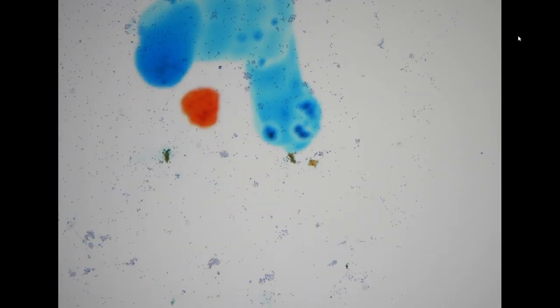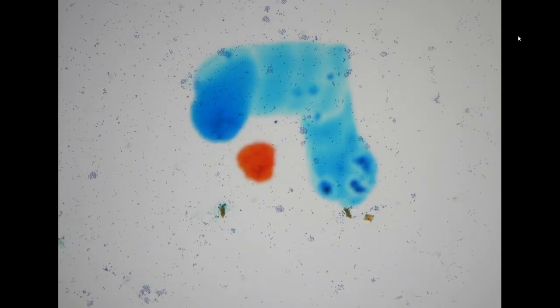The next specimen is kind of similar, except that the patient doesn't have a confirmed history. This is an ascites specimen coming from a 51-year-old female. She came to our emergency room department, and the clinician sent only two specimens, each with 2 milliliters of ascites fluid. That's it. They suspect there's a pancreatic cancer.